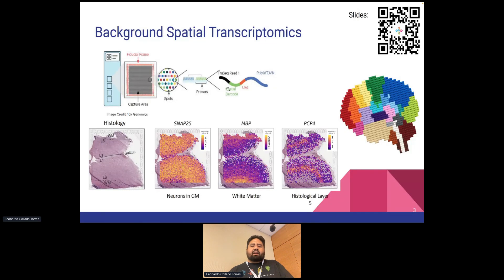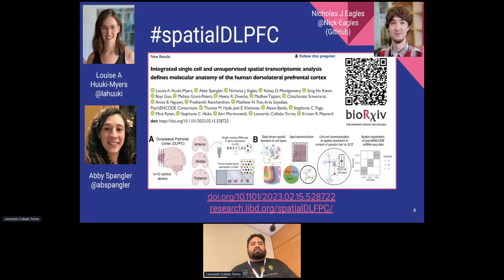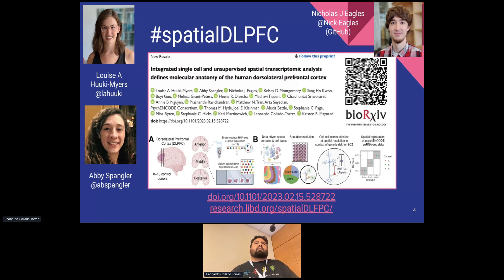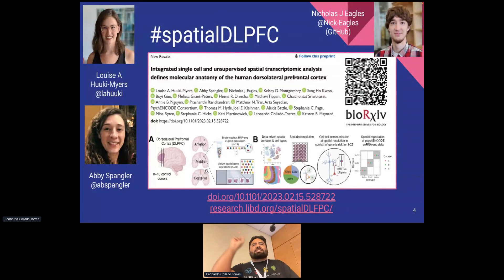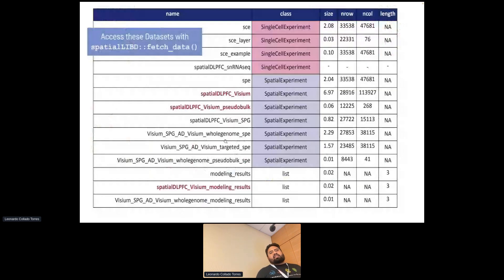These plots were made with spatialLIBD with a little bit of Illustrator. Earlier this year we posted a preprint called spatialDLPFC — DLPFC stands for dorsolateral prefrontal cortex. It's our largest spatial dataset: 30 Visium samples from 10 different donors, covering anterior, middle, and posterior DLPFC. This work was led by Louise, Abby, and Nick. That's one of our recent datasets, highlighted here in red, and the fetch_data function from spatialLIBD lets you access it.